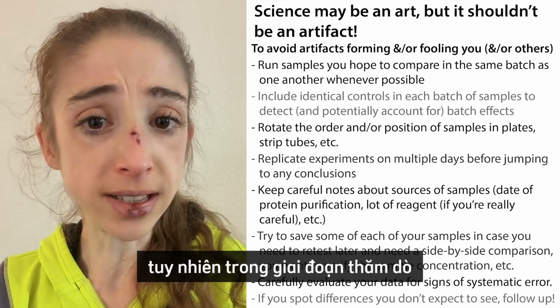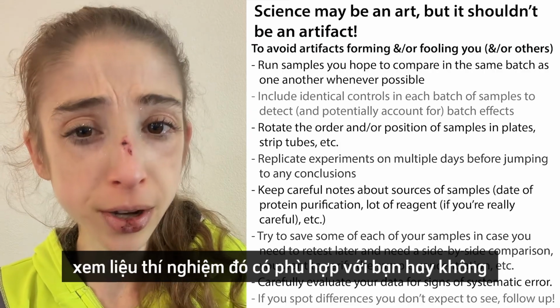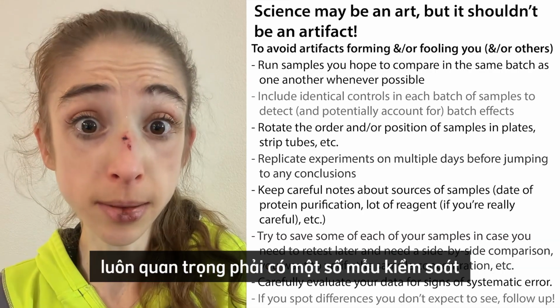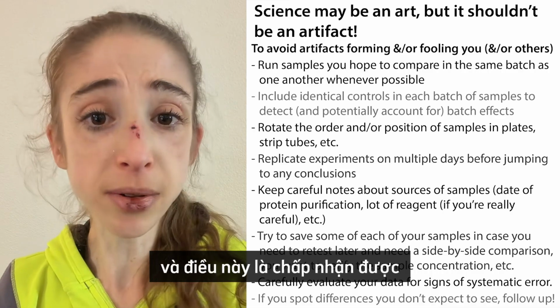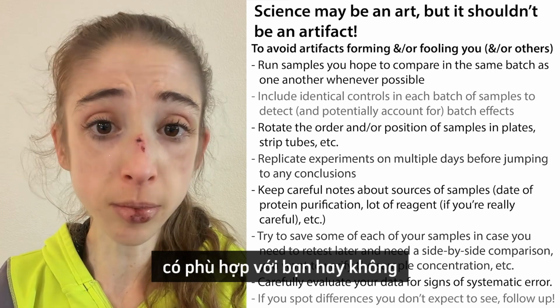In the scouting phase, however, when you're just trying to learn an experiment, figure out if an experiment might work for you, then often we're going to be more lax in how we set up these experiments. It's always important to include some controls, but not as many, and you're typically not doing as many replicates. And this is okay when you're just trying to start out and see whether the experiment might be appropriate for you.